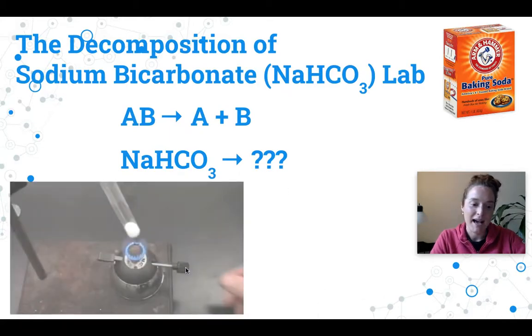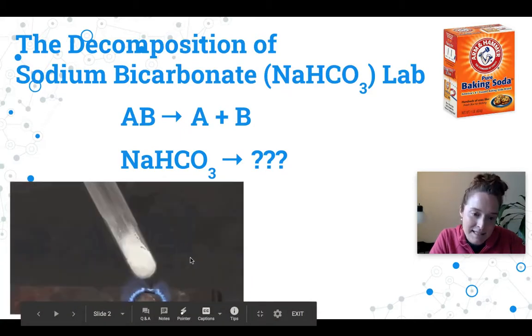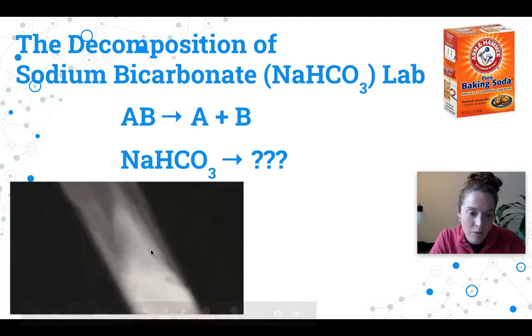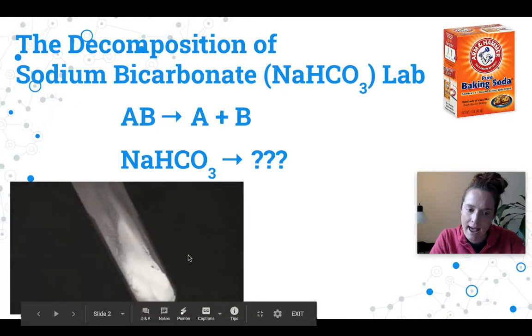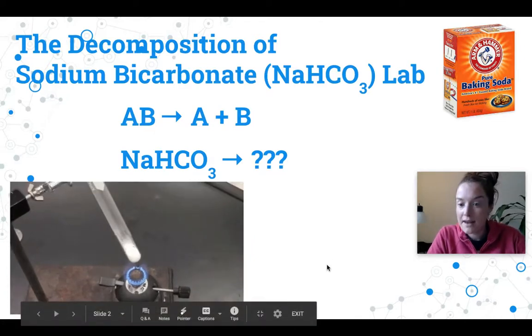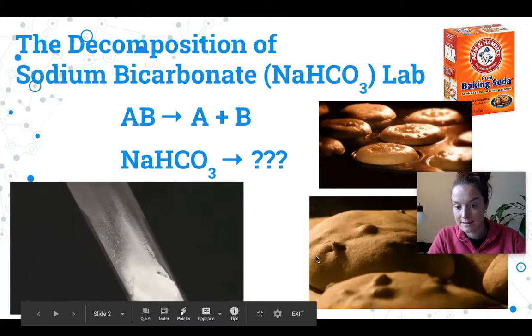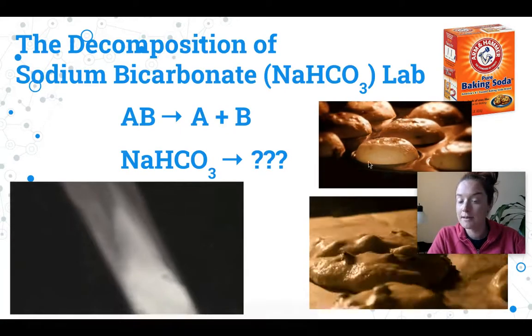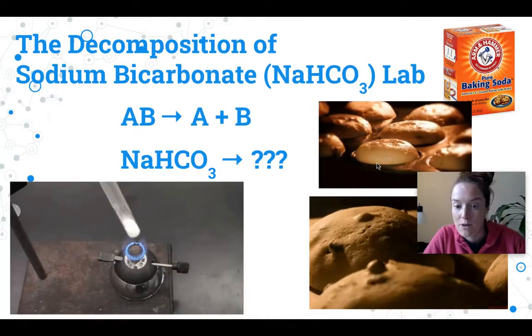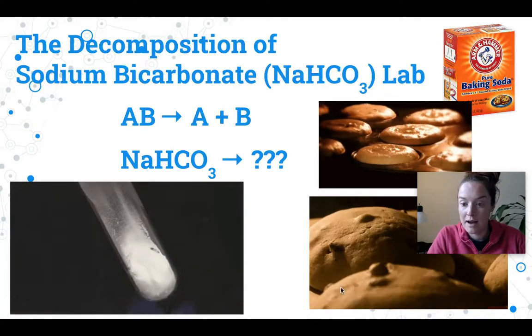And so here's some baking soda, some sodium bicarbonate being heated. And as you can see, one of the products is a white solid, and one might even be a gas. Can you see a little bit of gas being released there? Well, the reason they call this baking soda is because it's used in a lot of baking, and that same gas that's getting released gets trapped in your baked goods, and so it makes them rise and makes them nice and fluffy. Pancakes, waffles, cookies, cakes, all of these things use baking soda to become more fluffy and tasty.